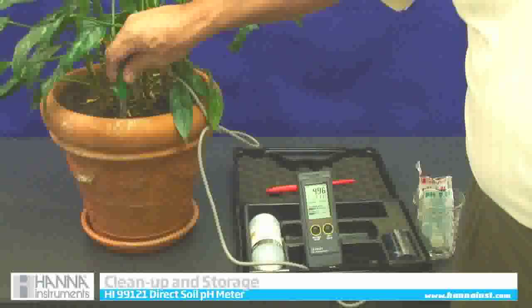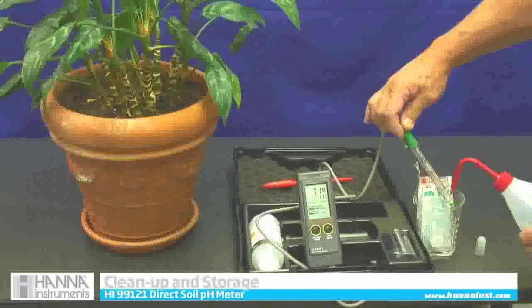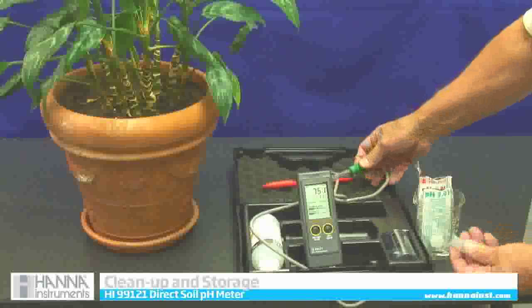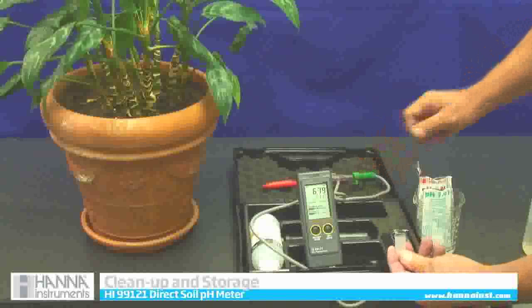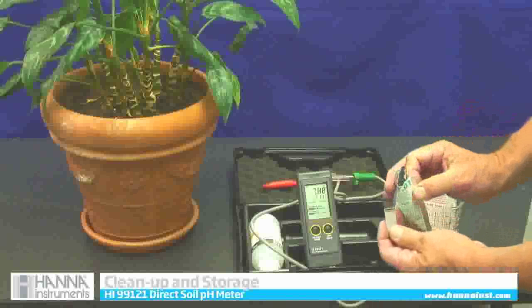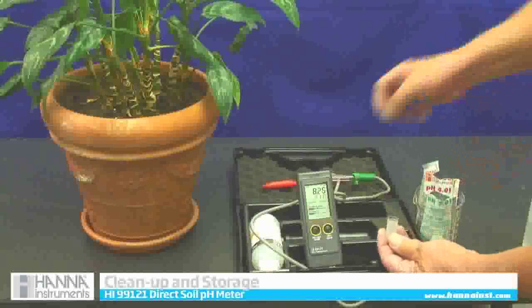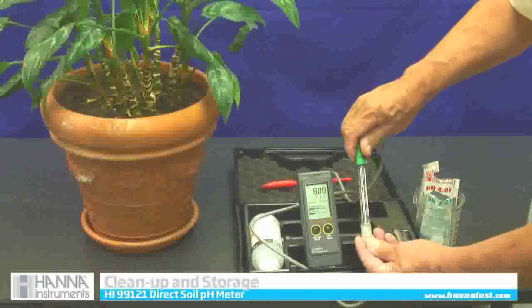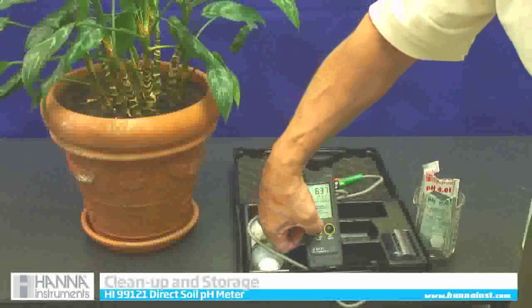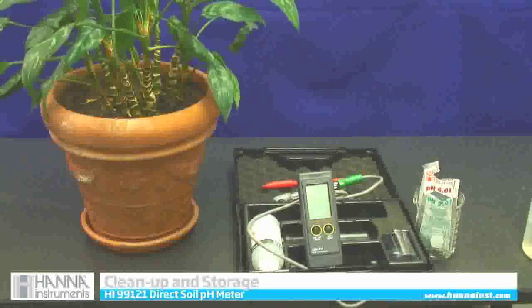Now to store the probe, I am going to take it out of the soil and rinse it off. What comes in the kit is this cap — a nice little cap. I am going to take one of my buffer solutions; it does not matter if it is the 7 or the 4. Put a couple drops in — don't need much. Store the cap, and now I am good for quite a while. I can turn it off, and it also has an automatic 5-minute turn off. And I am done.